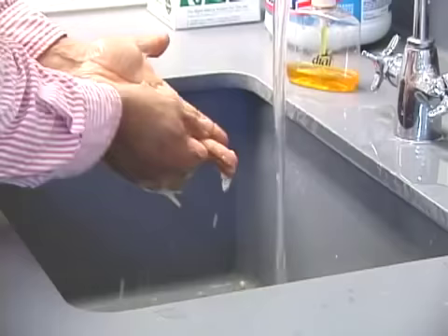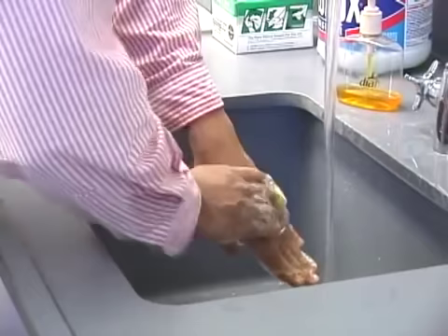Of course, you should always wash your hands thoroughly after removing your personal protective equipment. And don't forget to inform others that they can return to work now that the spill has been safely cleaned up.